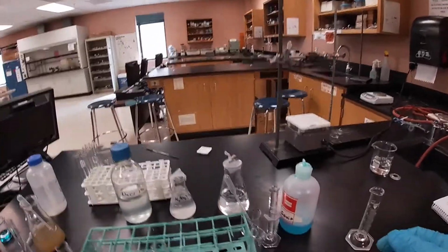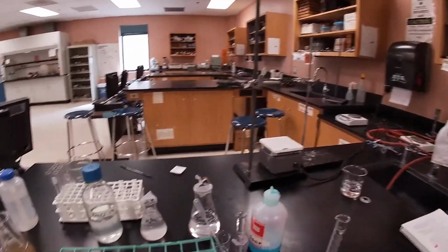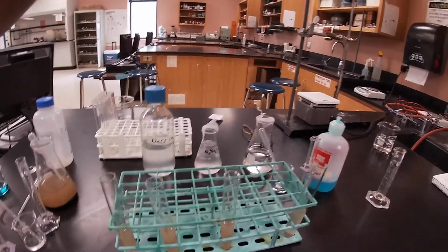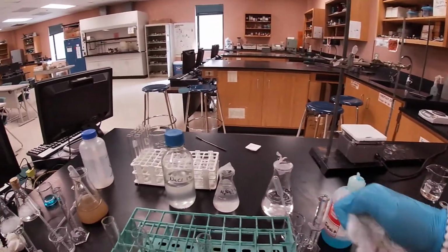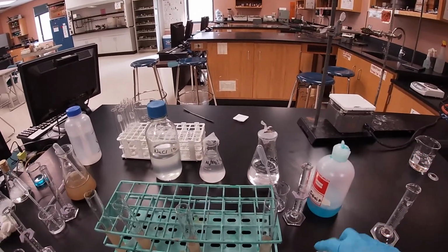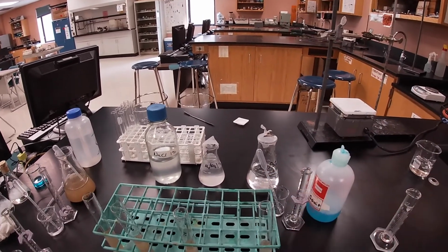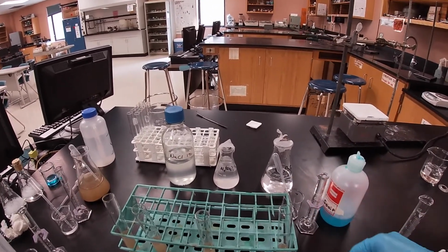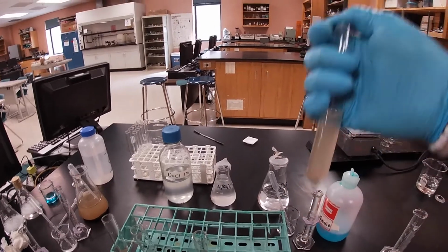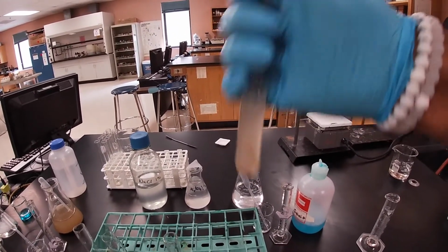And then the last one is gonna be our final one. Go ahead and get a smaller look at this all here. Go ahead and make our shake.